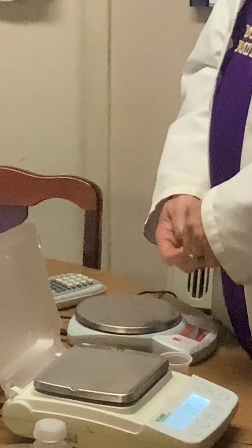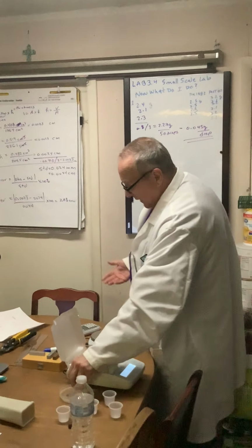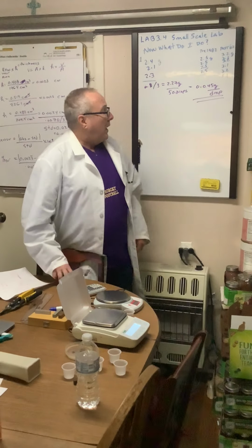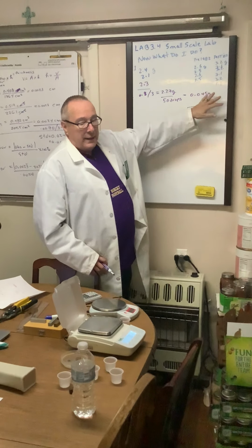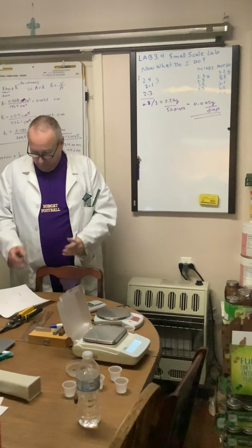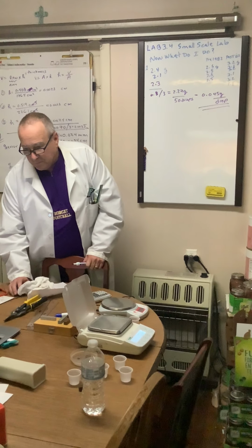So I was using this balance. Every other one was measuring 3.2. Not every other one, but in general about half of them. And so I had these different values for my pre and post 1982 pennies, and we're going to discuss that. So, let's answer our questions.